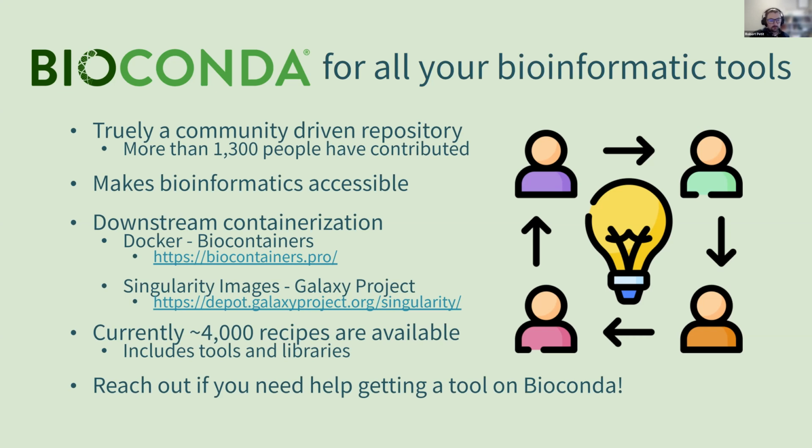Another important thing that comes out of Bioconda is the downstream containerization of every tool in Bioconda. Every recipe that gets submitted and accepted into Bioconda gets a Docker container created by Biocontainers, and then the Galaxy project also creates a Singularity image from those Docker containers. So you have roughly 4,000 recipes on Bioconda, so 4,000-ish Docker containers and Singularity images. If you made a tool and want to put it on Bioconda, don't hesitate to reach out to me or the Bioconda team. There's a bunch of people willing to help get it out there, and it really helps people to use your tool. Bioconda is a great resource for the community, and I'm happy to be a part of it.